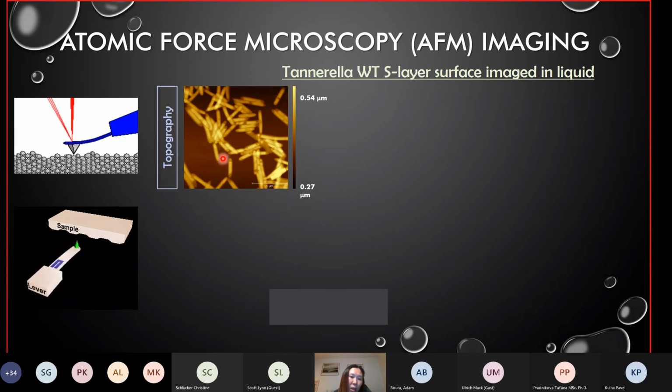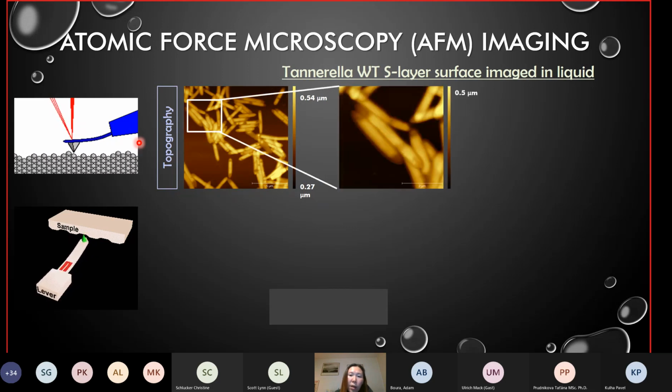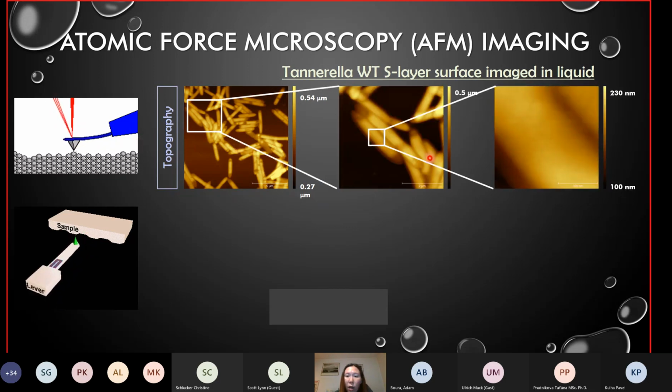And it is known as a surface protein structure on the bacteria surface to promote or help better adhesion in our teeth, in the oral environment. So first, when we apply the most known contact mode AFM imaging, as you can see, the cantilever scans the surface and then we detect the movement. And then we can see quite a bit of detail of this single bacteria surface.